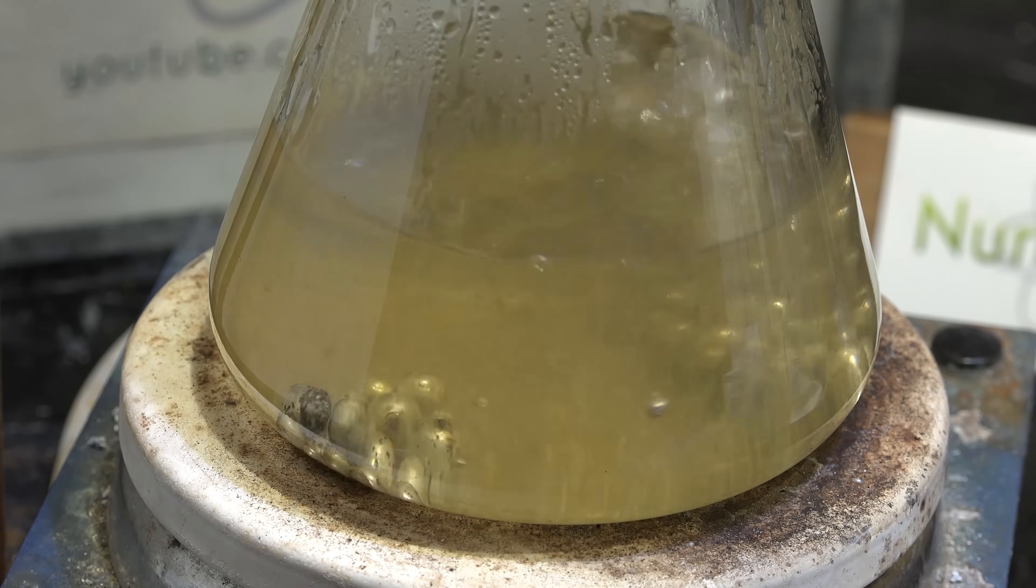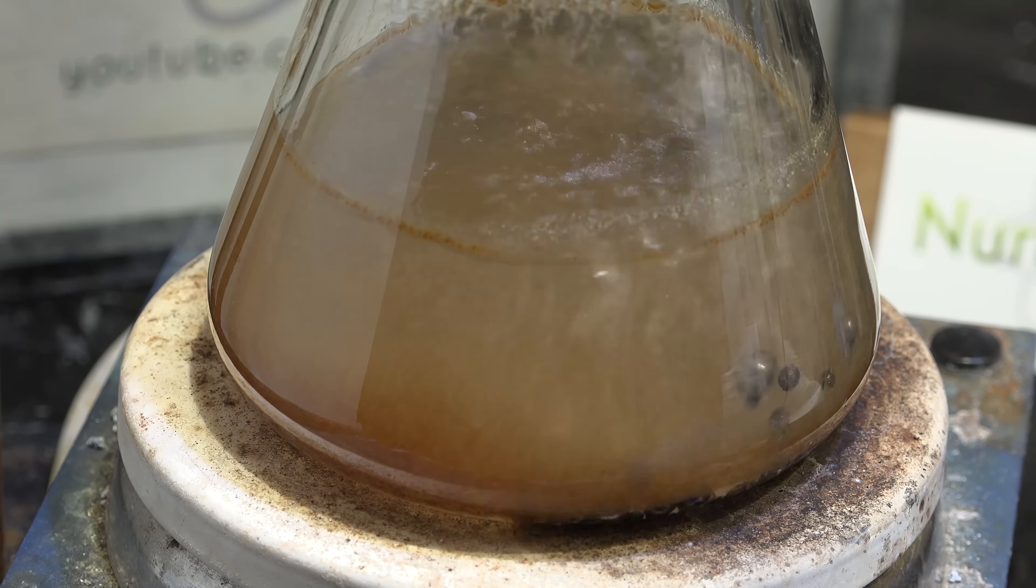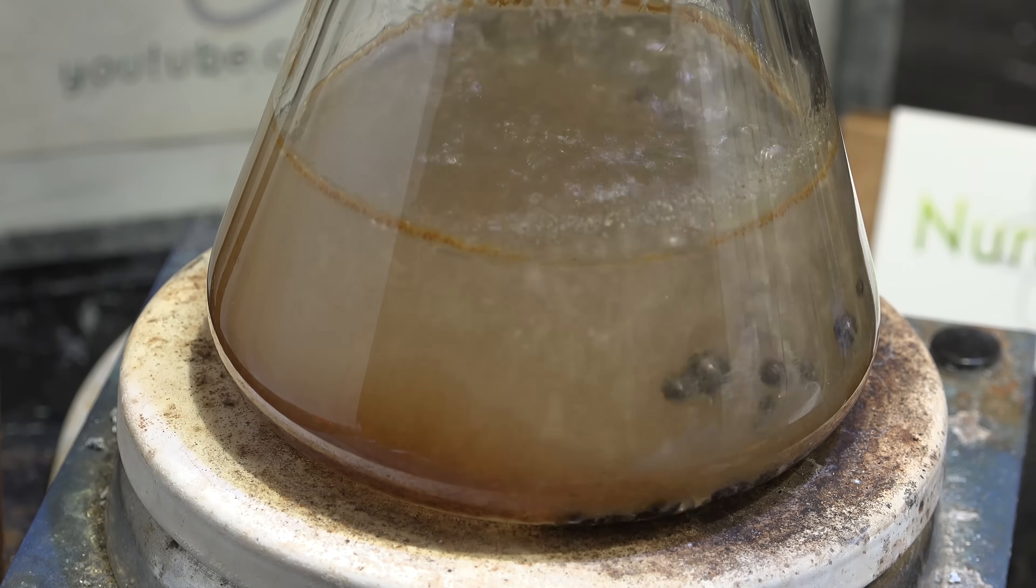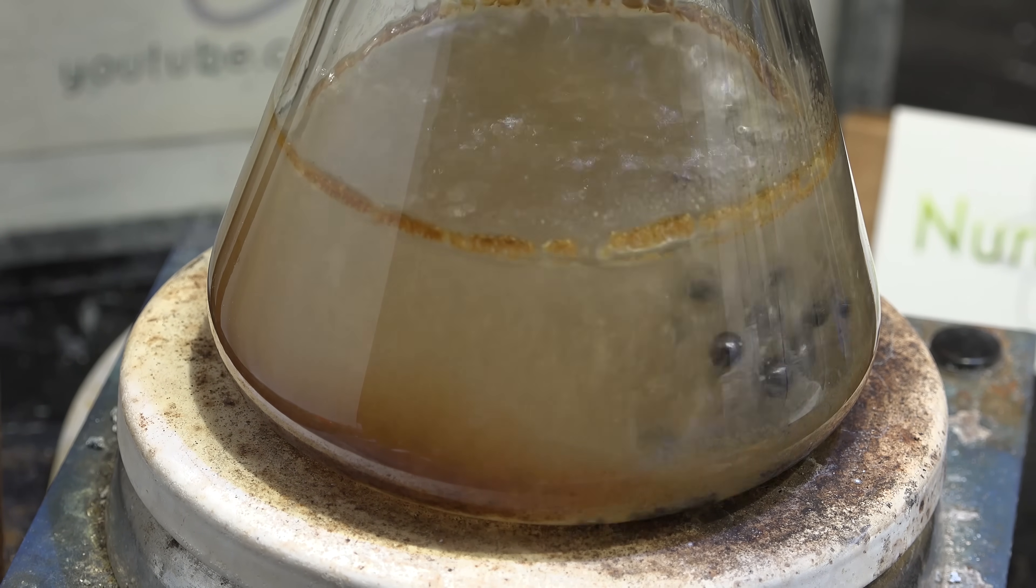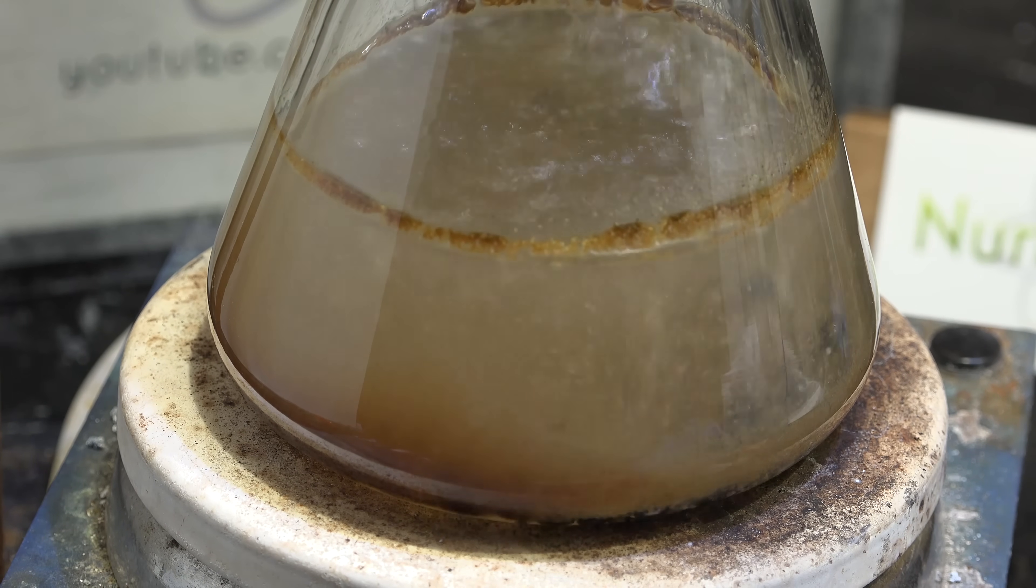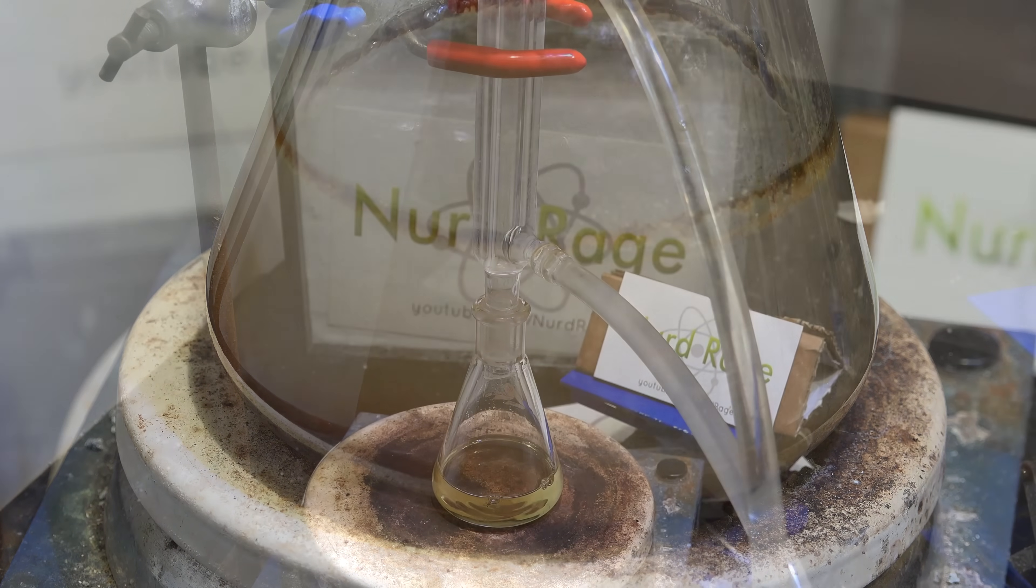So I needed a model experiment running under perfect conditions to see if making sodium this way was even possible. The experiment had to be so far at the extreme end of the theory that if the theory was sound it would have to work. Proving the theory possible would determine if I should put the continued effort in or abandon the project.